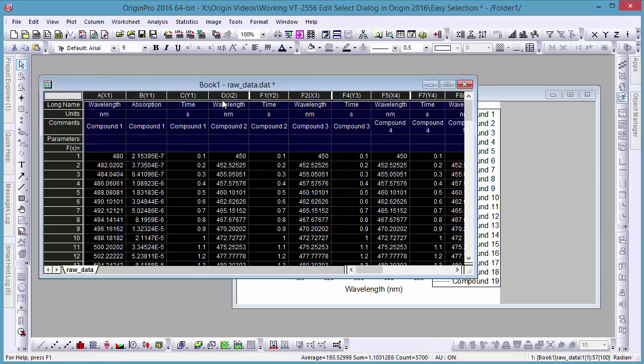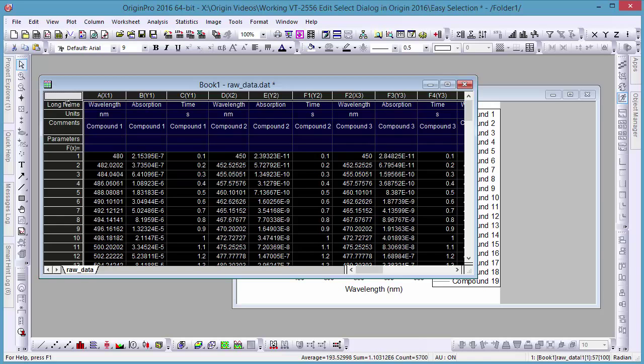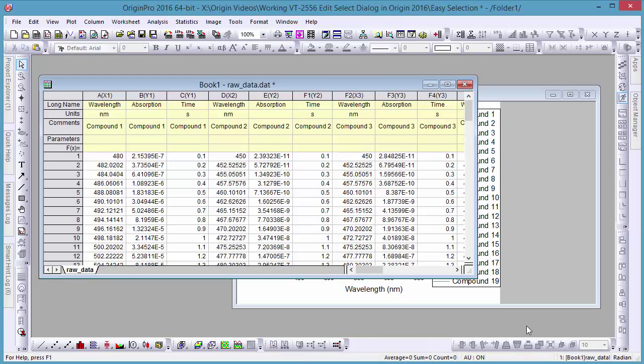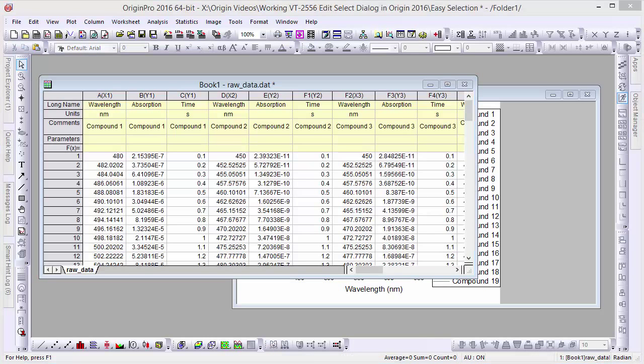Here you've seen a demonstration of some of the many versatile features that Origin contains for selecting specific data.